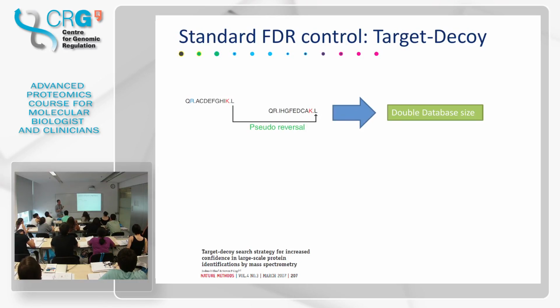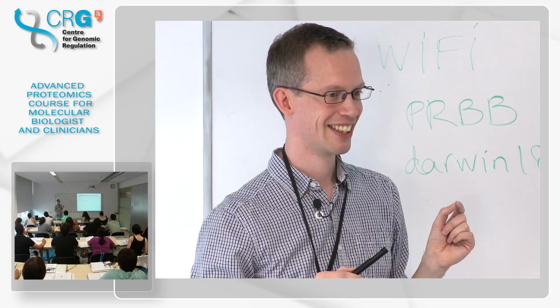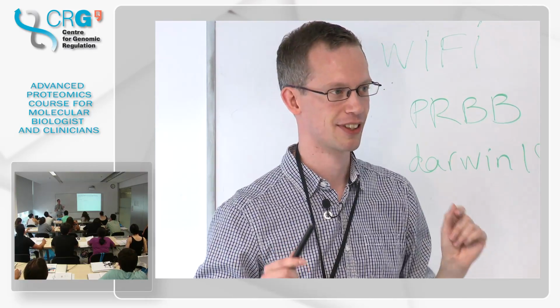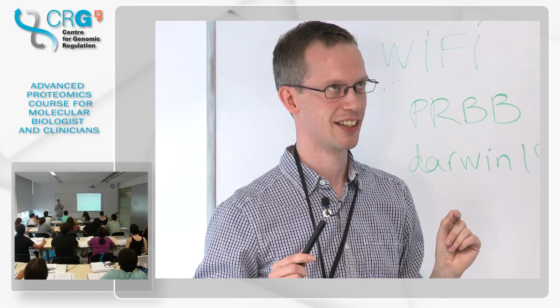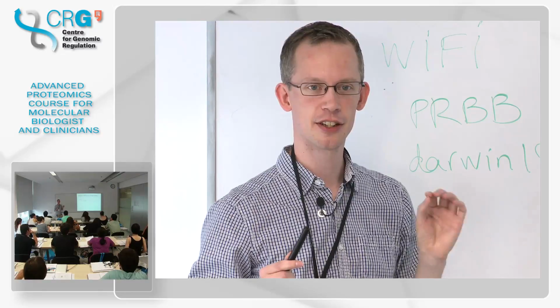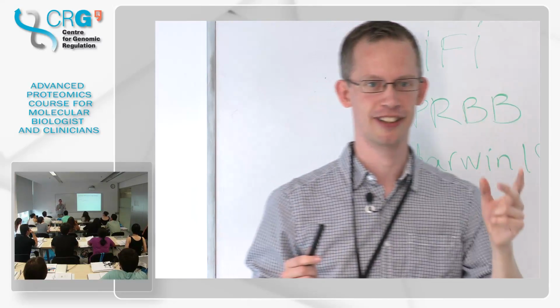So this means that you get the same distribution of masses in the forward and reverse sequence of peptide masses. You get exactly the same, almost. Yeah, actually you do. So it's quite a clever trick.